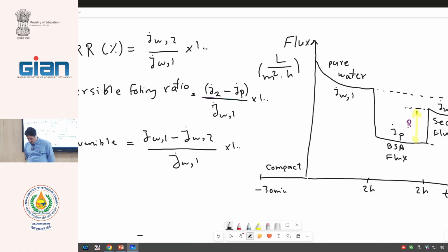And there are other equations that I will speak about tomorrow in the following section. We can calculate intrinsic resistance, cake layer, and pore resistance, and others. The usual test with UF, MF, NF is this test in the lab with the shown setups.